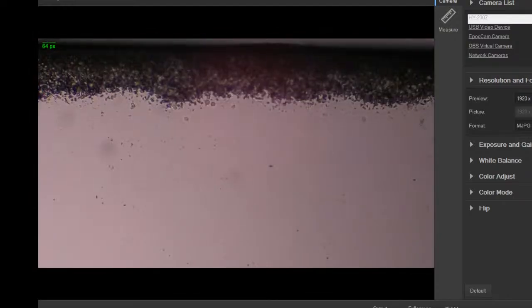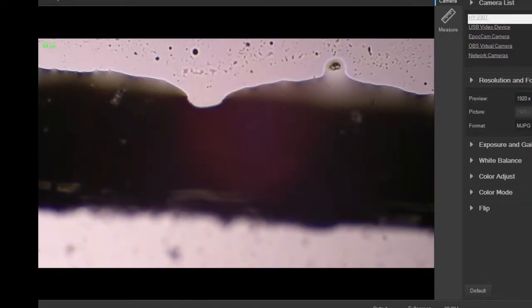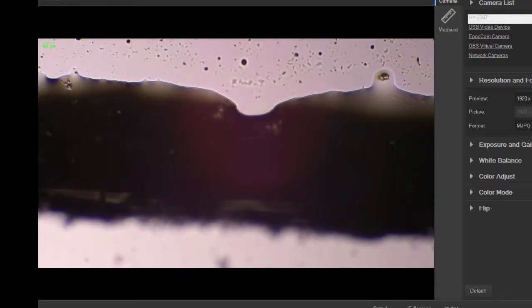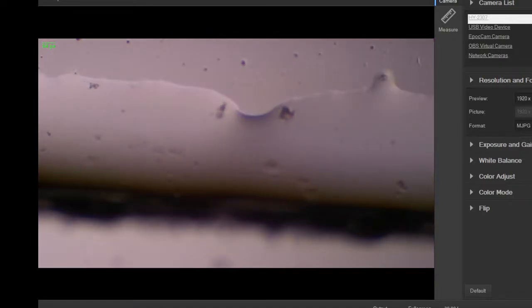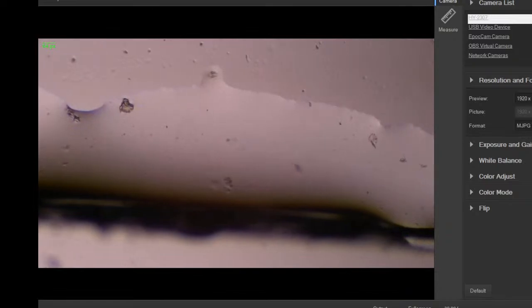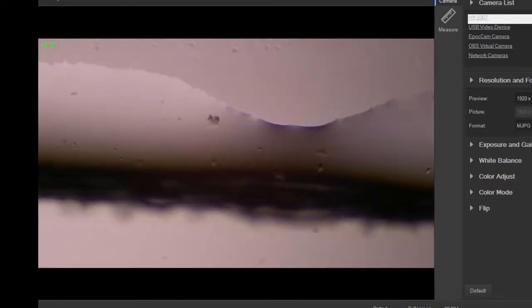All right, what do we got here? Let's make sure I got the edge of the slide. There you go. You can see some cool sorting out of the water balance there. There's a little, like a flume. Need some more light on this guy. There you go. You can see things flying by like they actually have a purpose, but it's just simple diffusion, sorting out the osmotic balance essentially of the area.